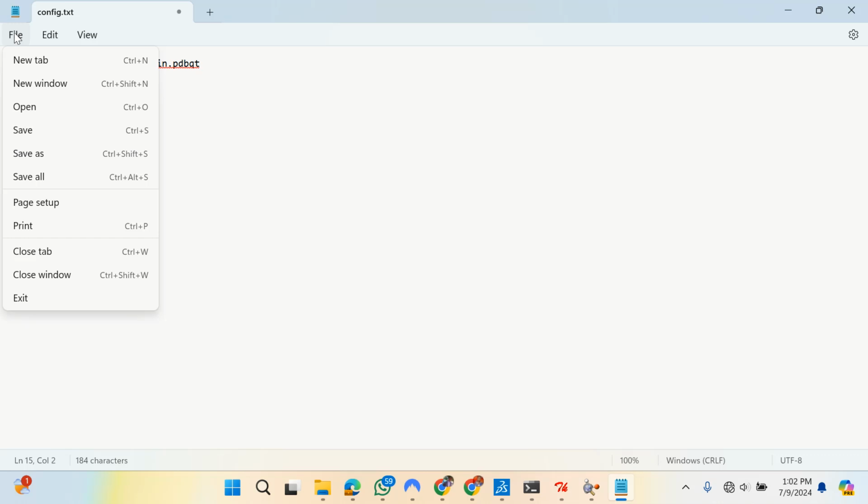Are you with us? But from starting now, it's already there. We have already copied it to the folder. But I'm saying, assuming you just searched config, just to locate a config in your file, and it's not in your folder. You can open it from anywhere. You don't even need to copy. After working there, you can now go to save as and locate your new folder and save in that.